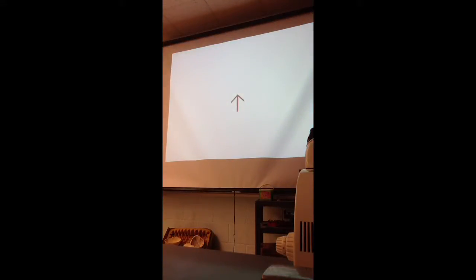The next slide we are looking at is the vas deferens, the long tube that is outside the testis. The best way to identify vas deferens is looking at its wall. It has a really thick wall, three layers of smooth muscle in the wall, really thick wall with a really narrow lumen. Right? Really narrow lumen with a really thick wall. That's vas deferens.